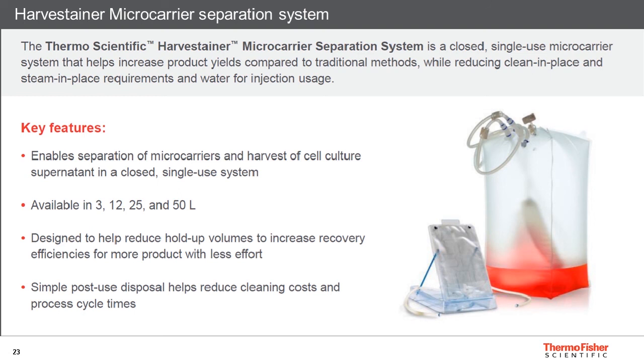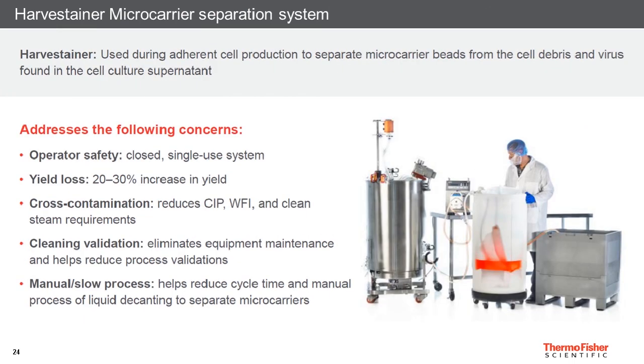Again, when you're working in a single-use environment, being able to do every step in a single-use way in a closed system is a great advantage. There are quite a few advantages. Again, there's a lot less manual handling. It's possible to make all the connections in a sterile way, so we don't have to worry too much about operator safety as well, because everything is closed and disposable. High yield. Again, cross-contamination becomes a non-issue because that's one of the greatest advantages of single-use systems in general, and cleaning as well. So there's no cleaning when everything is single-use.